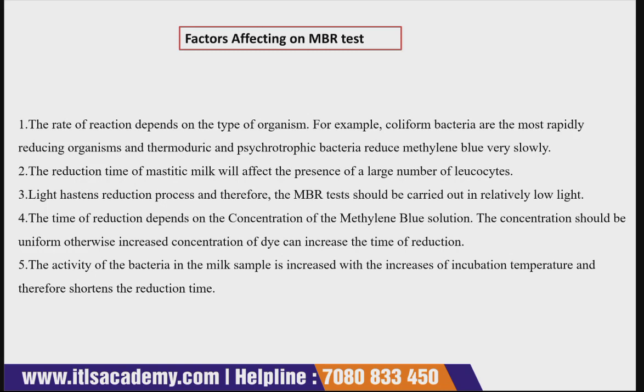The fourth factor is the concentration of methylene blue solution. The concentration should be uniform, otherwise the increased concentration of dye can increase the time of reduction.